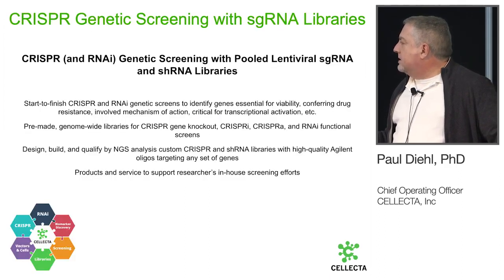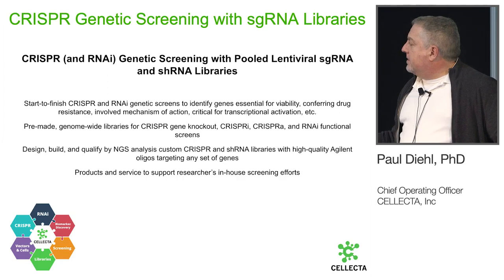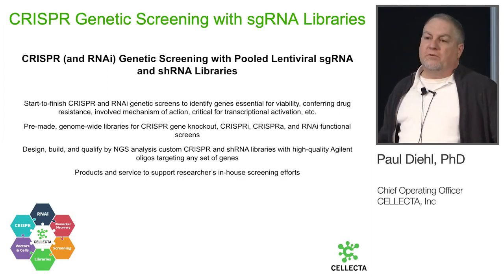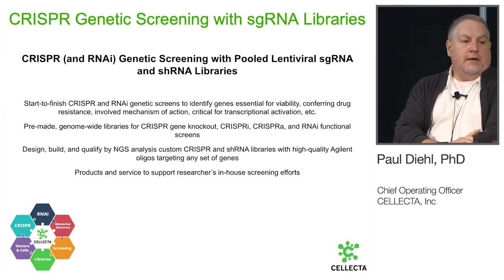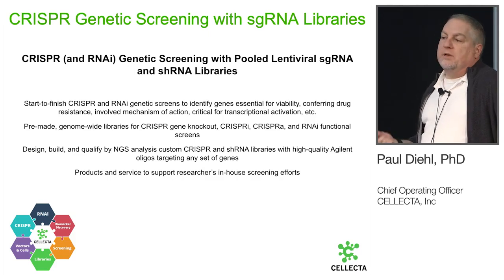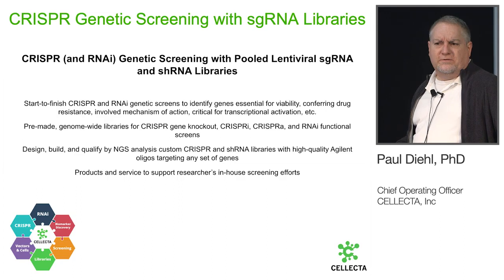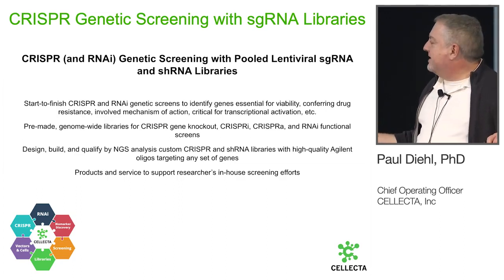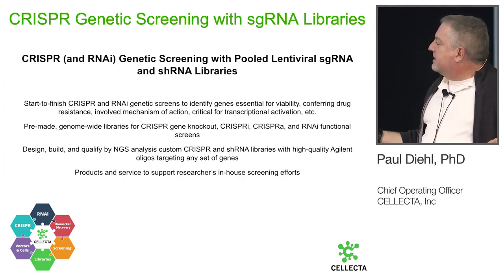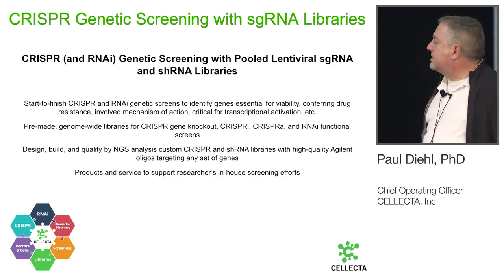So I'll just talk a little bit also about the CRISPR technology and the genetic screening that we've done, and this is really what the company was founded around. The company started in 2007, as I mentioned, and at that time we were focused really on shRNA, RNAi, and it was pooled RNAi screens, and then rapidly with the publications in 2012, 2013 for the screening, in 2013 we started to get involved in looking at sgRNA and doing pooled sgRNA libraries.